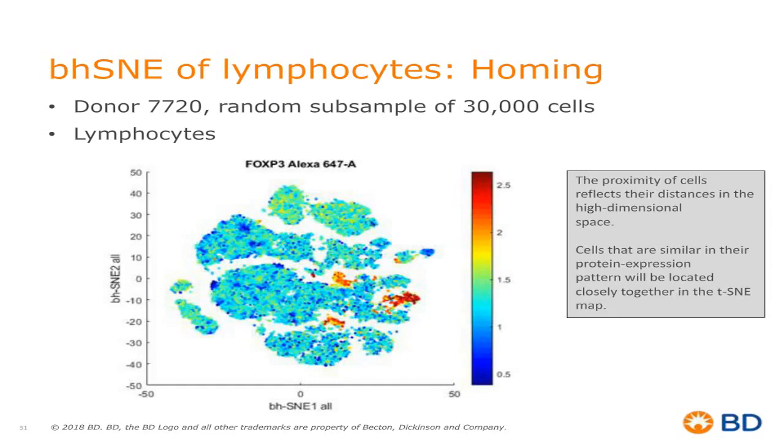And in this situation, we can now see that when we look at our FOXP3 expression, they're actually kind of spread out a little bit. They didn't all cluster together. And that may seem surprising, but when we think about it, when we've added in these new homing markers, it kind of clustered all of the cells together, all the lymphocytes, the CD4 T cells, the CD8 T cells.